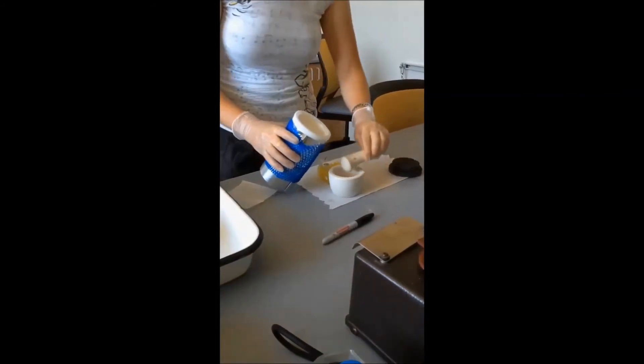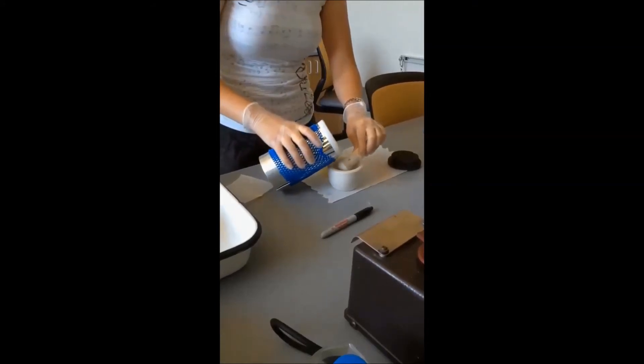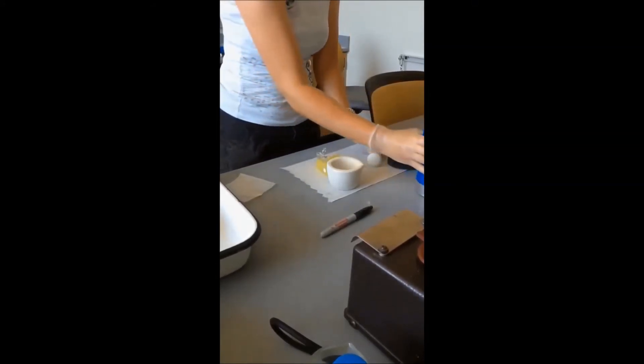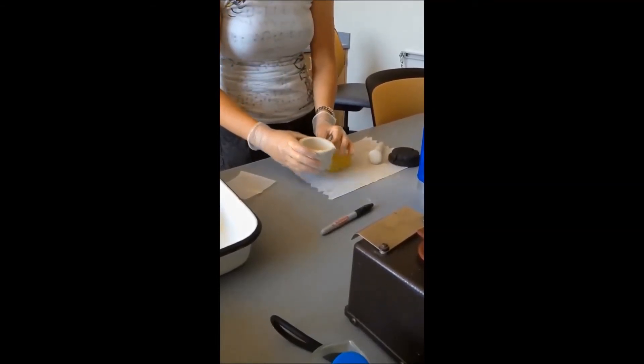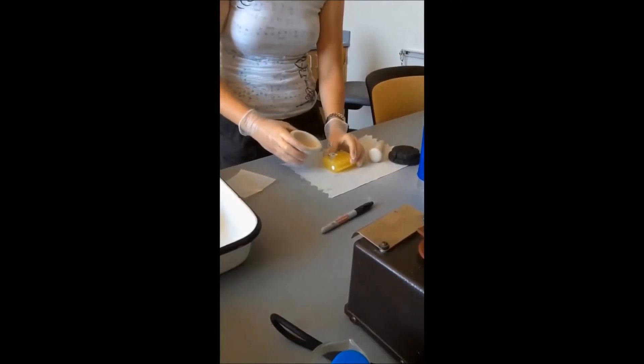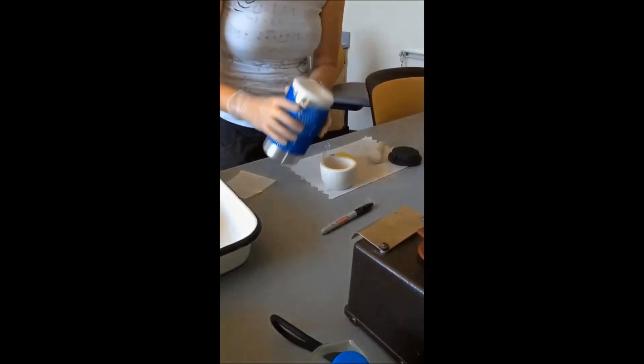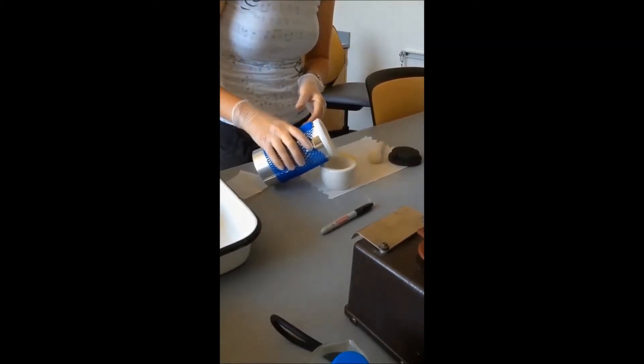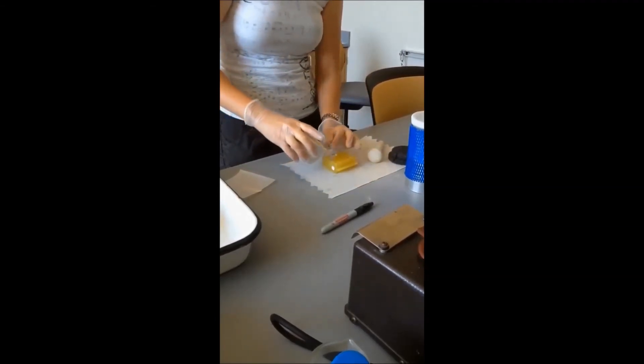So we're going to add the pestle back here just to aid in the transfer. And then we're going to let a little bit of that evaporate off, not too much. And we're going to carefully let a little too much evaporate off that time. And we're going to carefully add it to our tube.